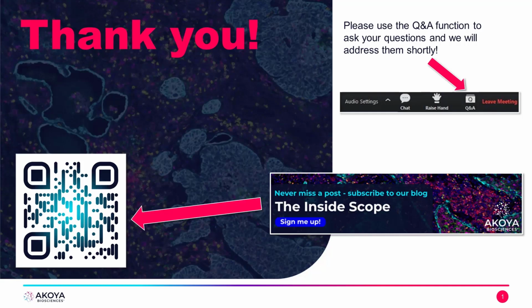Okay, questions about software. Are MAV and Visiopharm open access, and can Halo software be used for data processing? In our case, MAV is open access. It's actually a Fiji plugin, so if you've used ImageJ before, you can download the plugin and work from there. Visiopharm is not. Visiopharm is a paid software, similar to Halo. In any case, images coming from our Codex users are accessed through a variety of pipelines for both processing and analysis.